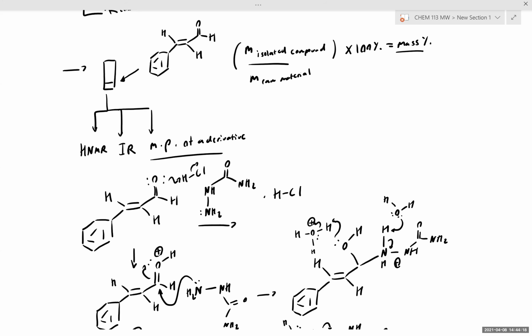Now, if we wanted to characterize cinnamaldehyde, can we take a boiling point? Would it be a reasonable technique in this lab to take a boiling point of cinnamaldehyde, considering all that we've discussed? No. And why? It will decompose. Exactly right. That's the entire reason why we did steam distillation. If we wanted to, there's another method of distillation that would also allow us to circumvent this decomposition issue. That's something to think about for your discussion.